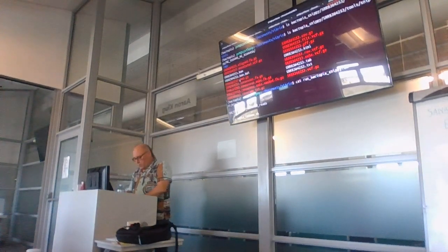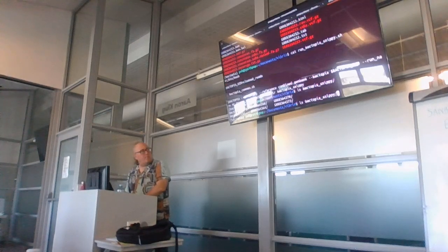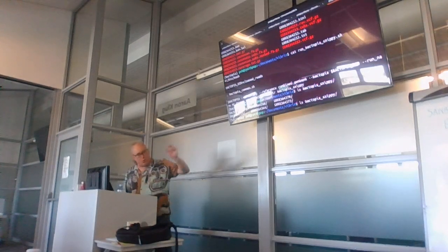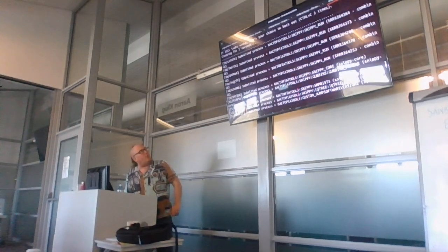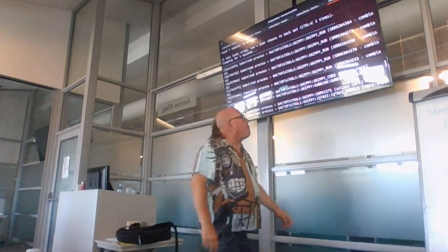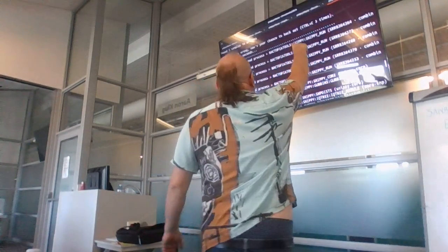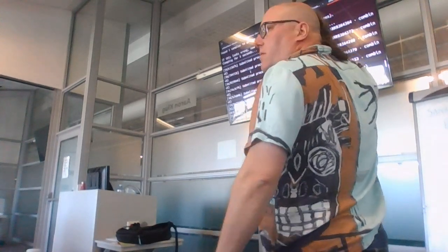But the other thing that we get is a Bactopia runs folder. Okay. Now, if we go back through what happened with the Bactopia run, then we see that for each sample, it ran Bactopia. Okay.